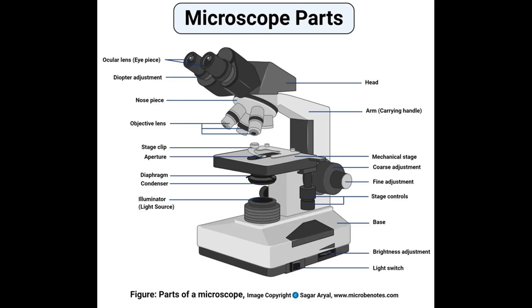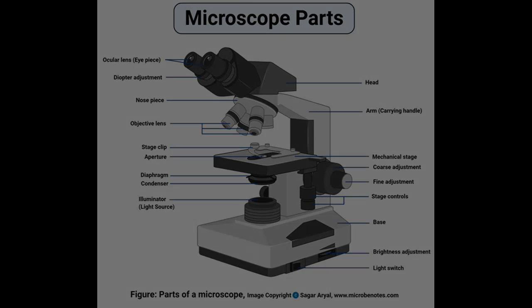or any other relevant information you might want to include to remind yourself about things like care for the pieces, how they can be damaged. It's really up to you as to how much detail you would like to include. So I'd just like you to watch this short video that summarizes some of the parts of the microscope and their function.